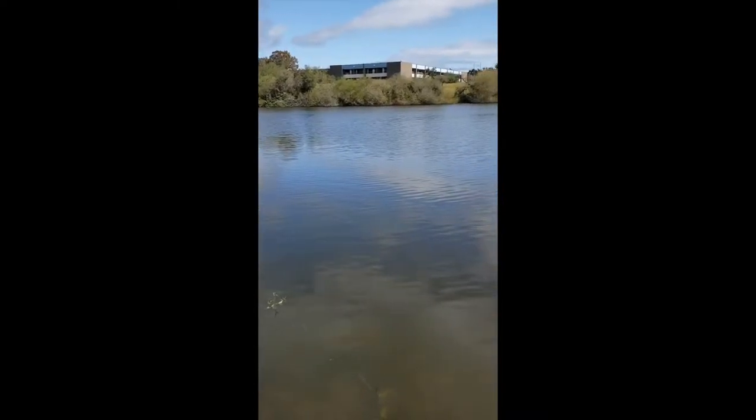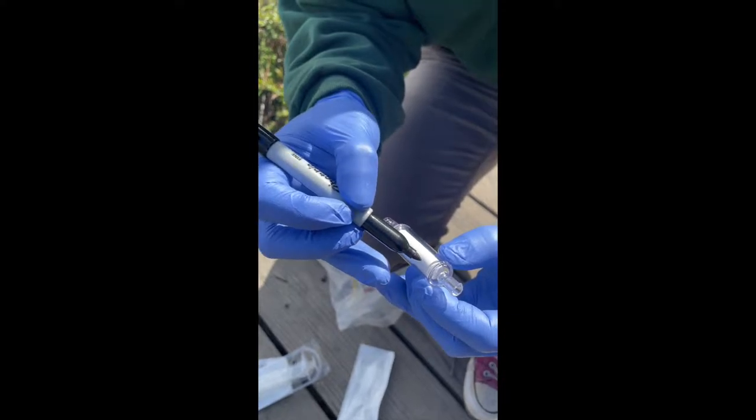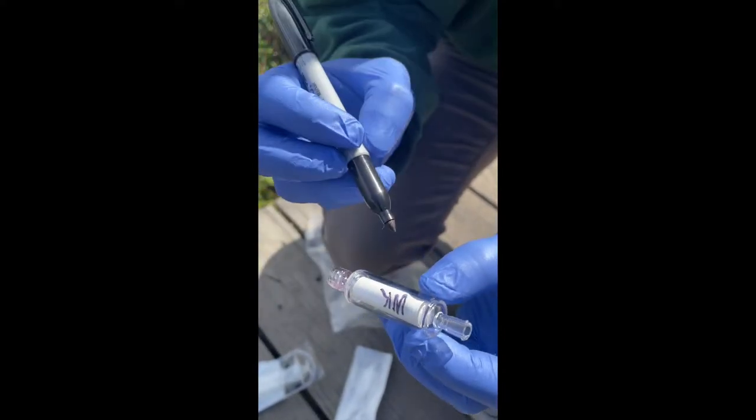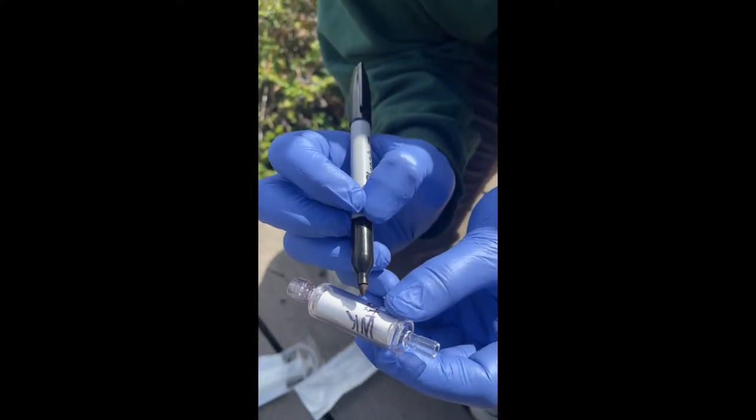Welcome to the Cal-e-DNA water sampling instructional video. Begin by removing the Sterivex filter unit from its container, being careful not to touch the sterile ends, and write the sample ID code on the side.